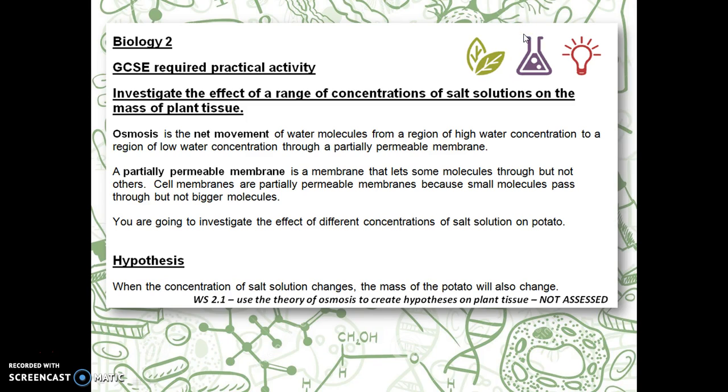So when you're looking at these practicals, there's various different bits you can be assessed on, so you need to make sure that you're aware of the practical overall and not just the little bit that you focused on in class. So in this one here, we're looking at putting some potato tissue into different concentrations of salt solutions.